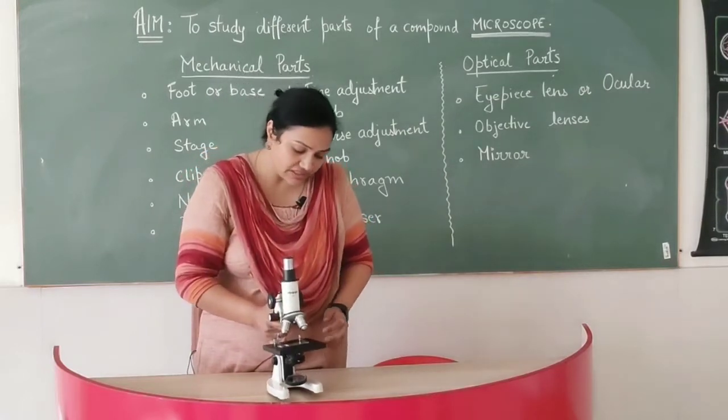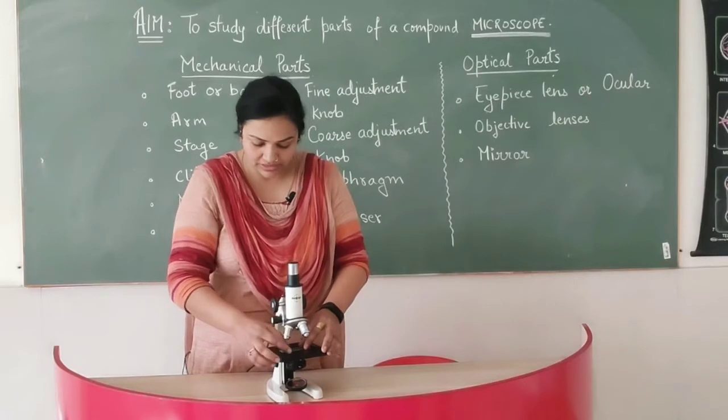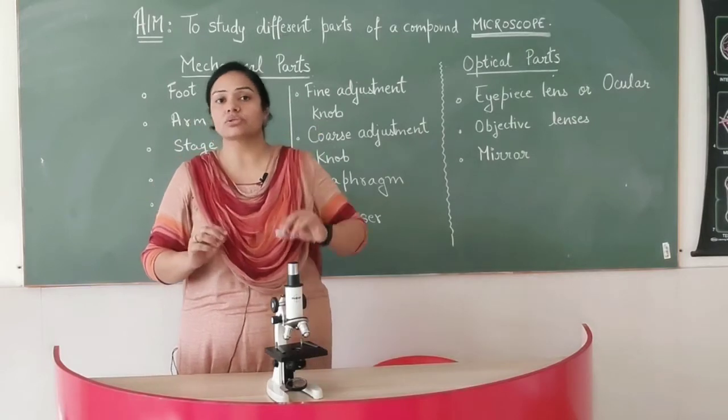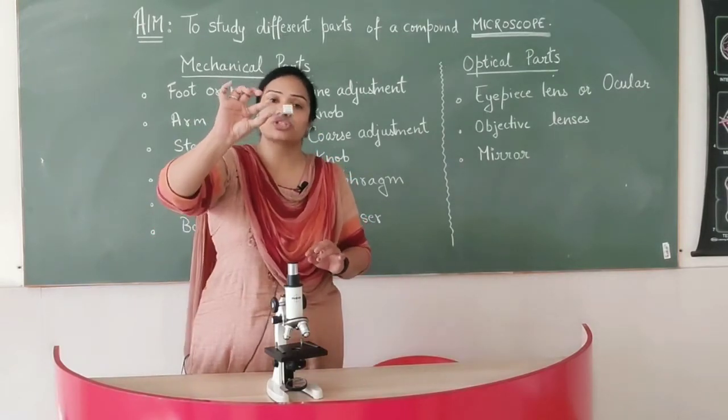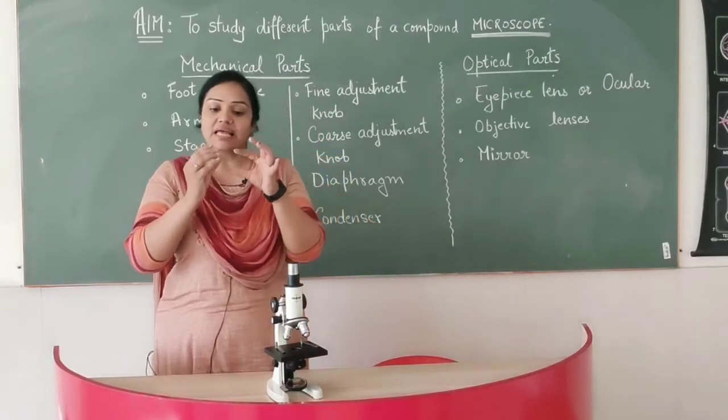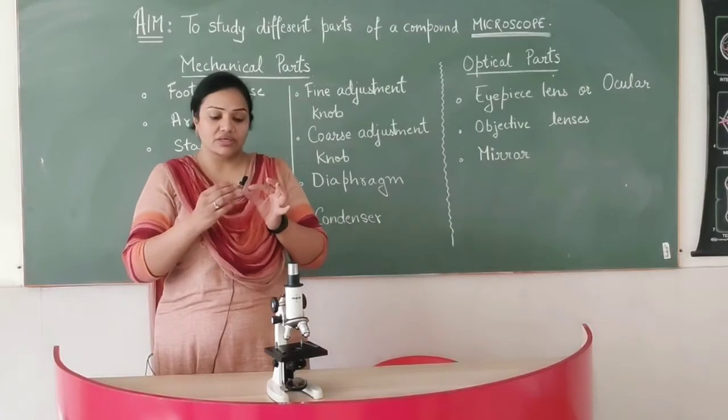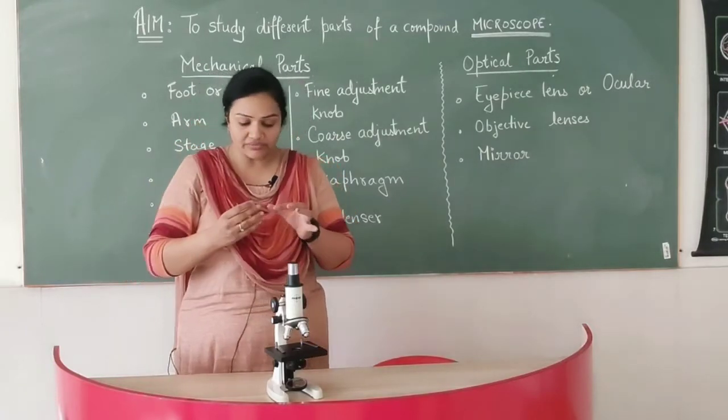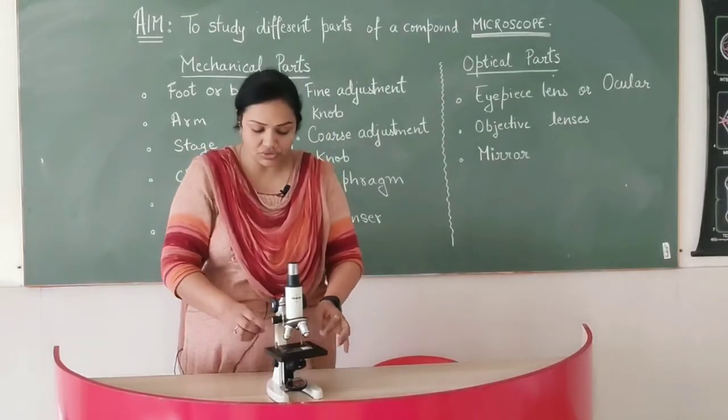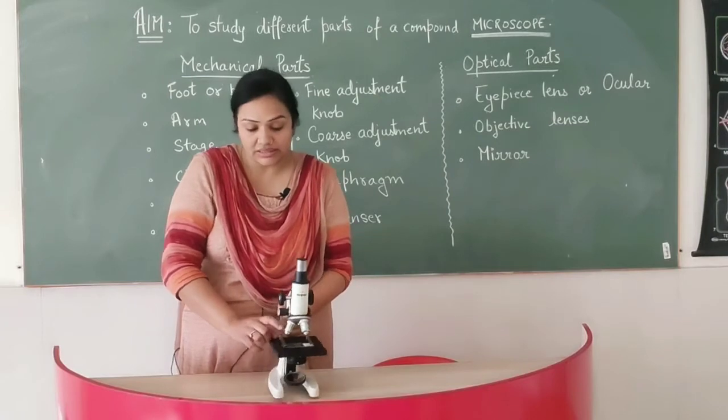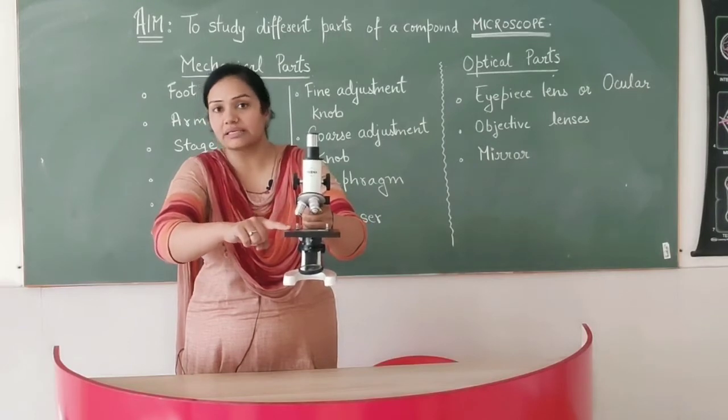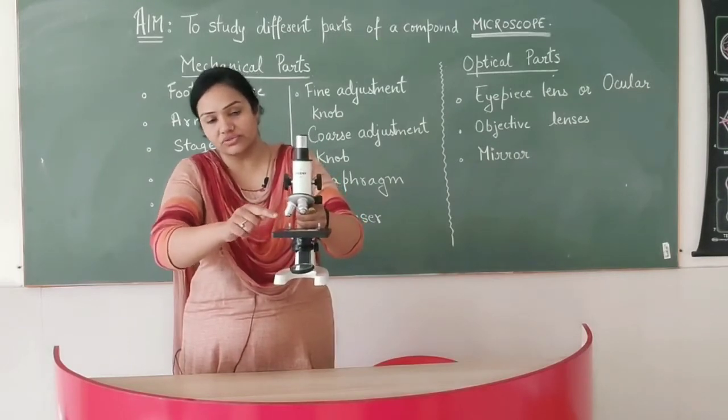Now when we need to see the object on the microscope, we are going to make certain kind of slides. We have temporary slides also and permanent slides also. This which I am showing you is a permanent slide. So we can see the cell or the tissue on these slides. Now when we keep this slide on the stage, there are two clips on this microscope. These two clips actually help to hold the slide so that it does not move here and there.